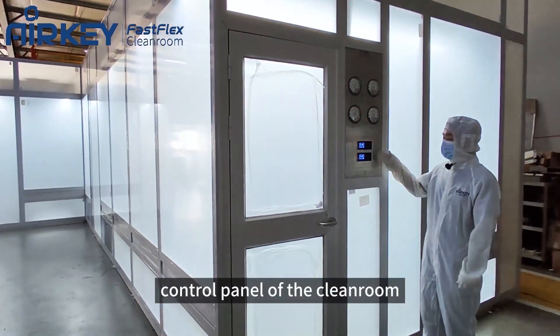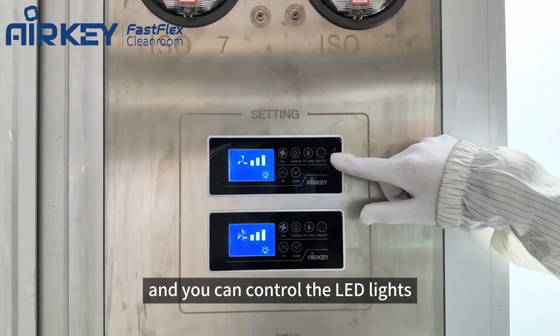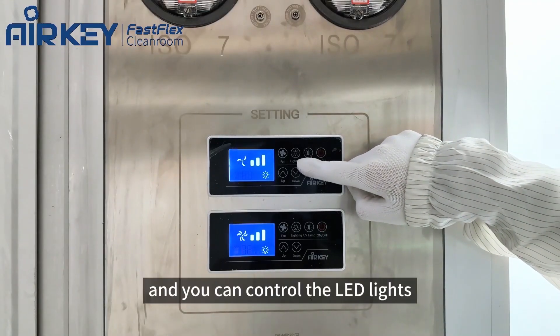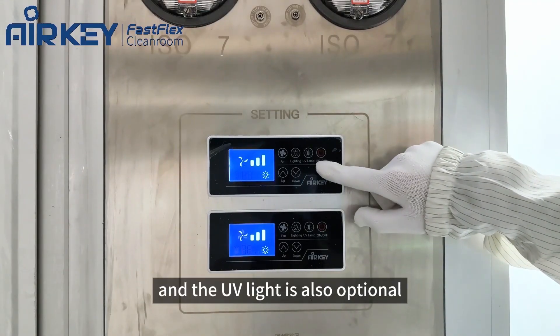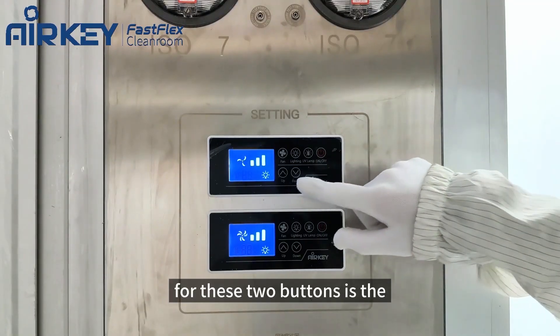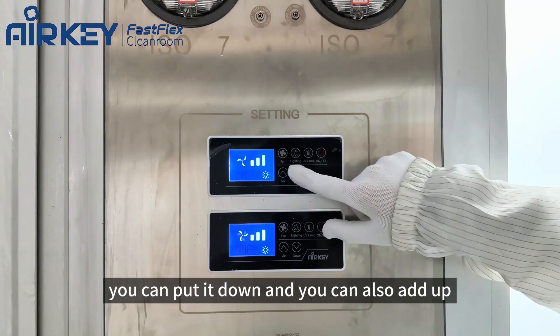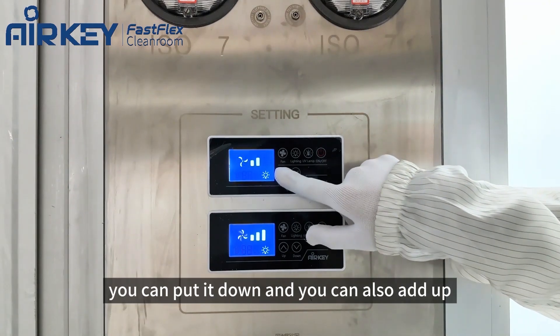Now you can see this is the control panel of the cleanroom. This is the power button, and you can control the LED lights — the UV light is also optional. These two buttons are the three-speed air velocity control buttons; you can turn it down or add up.